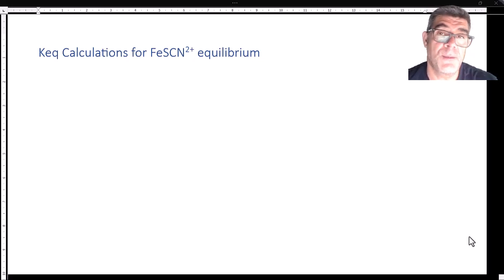However, because the absorbance value is so low, I have to have a line that passes through the origin in order to make sense out of the data that I have. I can't construct anything that's logical if I don't. And what that does is it increases the amount of error associated with this particular experiment. Nevertheless, we're going to push ahead and at least work through the calculations so that you have some idea of how to process this information.